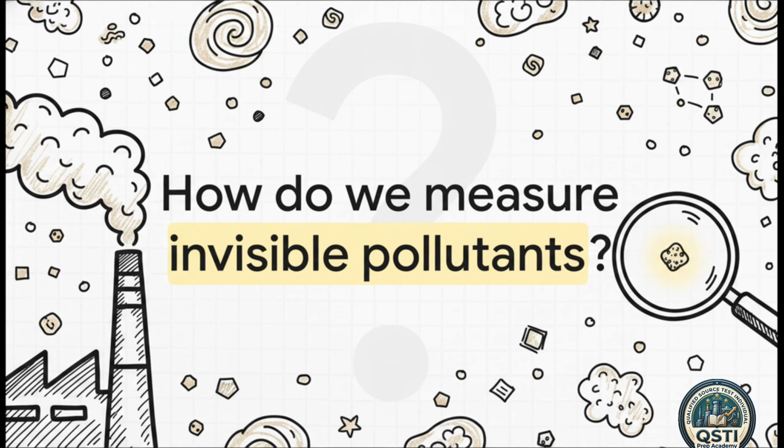When we look at stationary source emissions, which is just the EPA's term for fixed pollution sources like power plants or factory smokestacks, we aren't just looking at one simple chemical. We are looking at this wild, microscopic soup. You've got gases, heavy metals, volatile organic compounds, and tiny particulate matter all completely mixed together. Our job today is to figure out exactly how scientists actually manage to pull one specific type of invisible needle out of that very chaotic haystack.